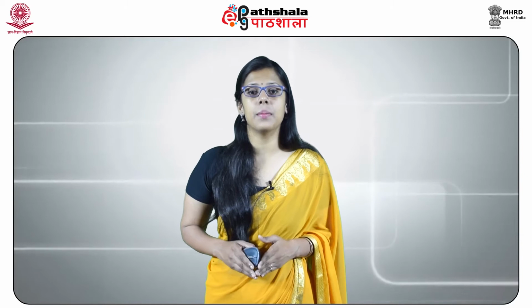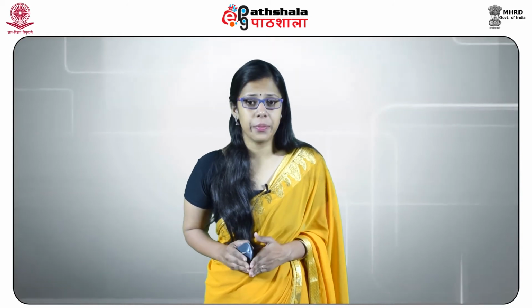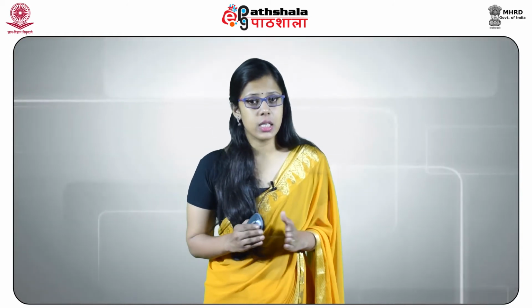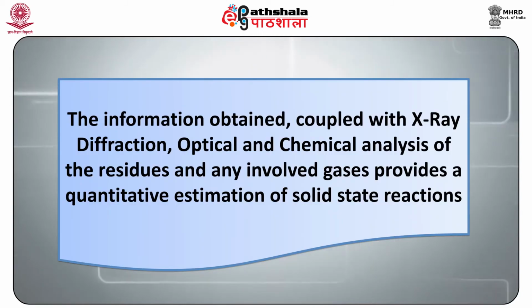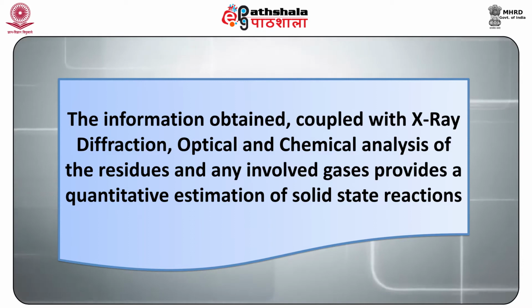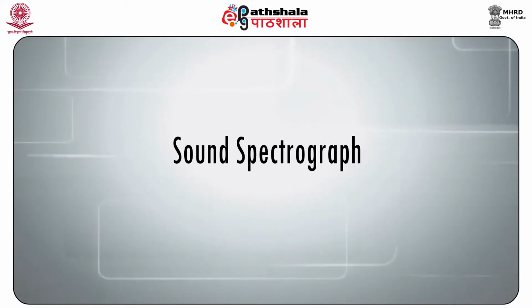The corresponding changes in weight are determined by thermogravimetric analysis. Complete thermoanalytical data are obtained only by utilizing both methods of analysis. The information obtained, coupled with X-ray diffraction, optical and chemical analysis of the residues and any involved gases, provides a quantitative estimation of a solid state reaction. Next we have the sound spectrograph.